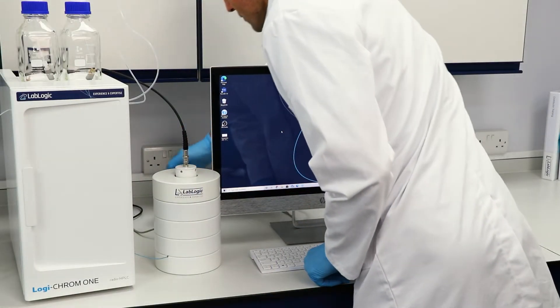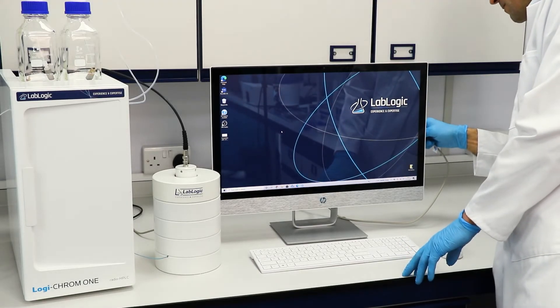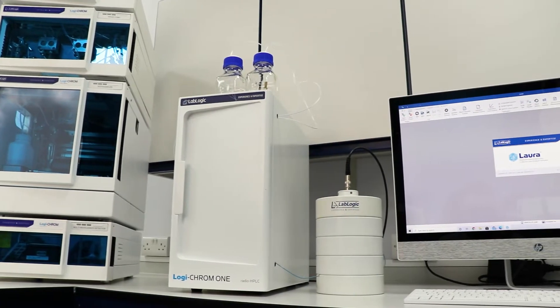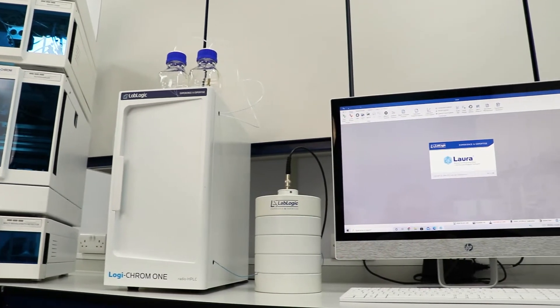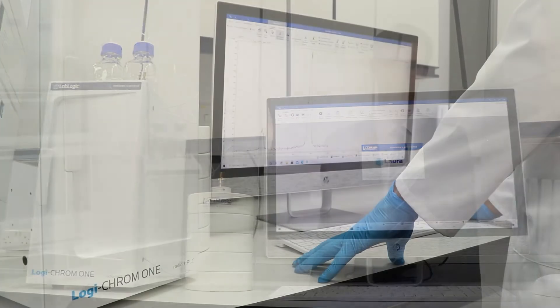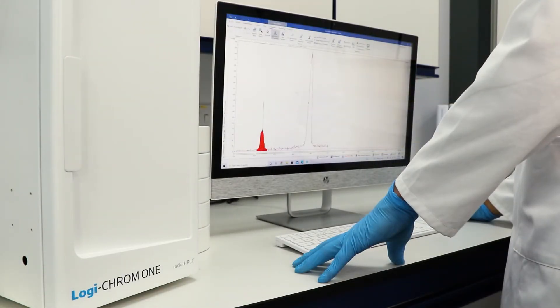Due to its simple design, the Logichrom One is a plug-and-play system. As with other LabLogic QC equipment, the Logichrom One is controlled by our industry-standard Laura for PET radiochromatography software. The benefit of the software is not just compliance, but it also provides powerful data analysis features.